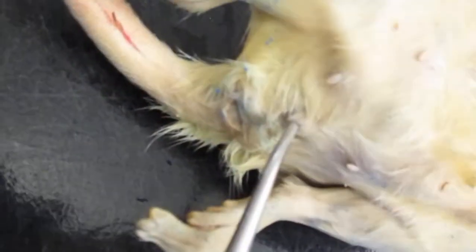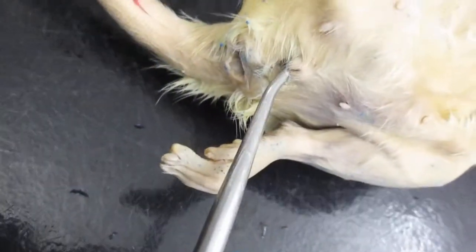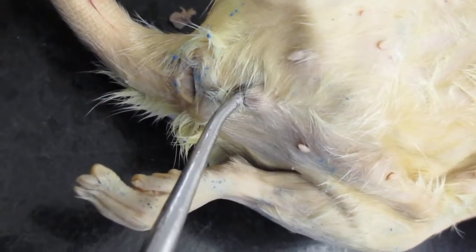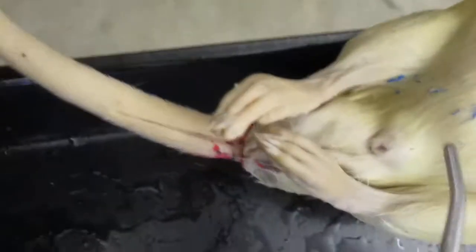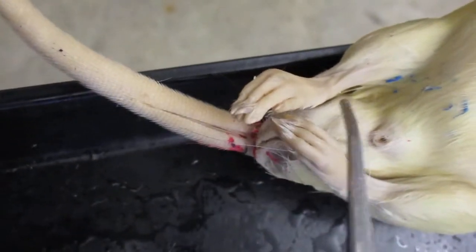I want to show you some things here. For the undissected female rat, you can see the urethral opening right here. Right there, urethral opening. And then you move that back a little bit and you can see the vagina. Right there. Urethral opening, vagina, anus. On the male, urethral opening, scrotal sac, here and here.